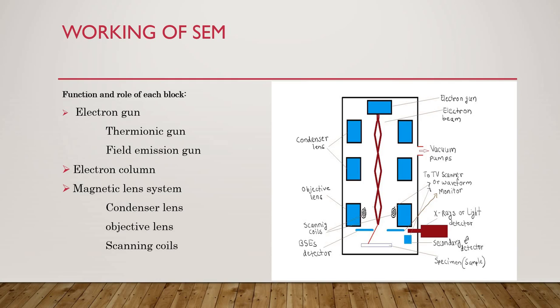Second, the objective lens aperture. This aperture is used to reduce or exclude scattered electrons. An optimal aperture diameter should be selected for obtaining high resolution secondary electron images.